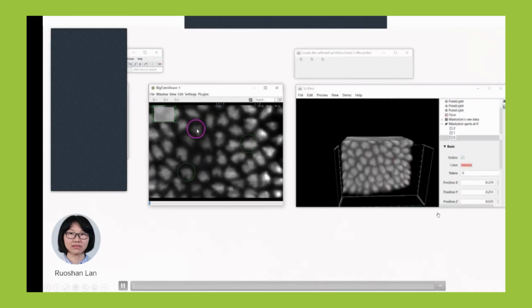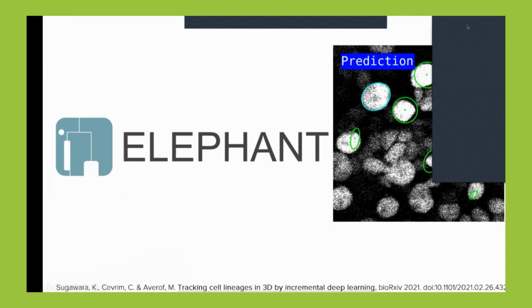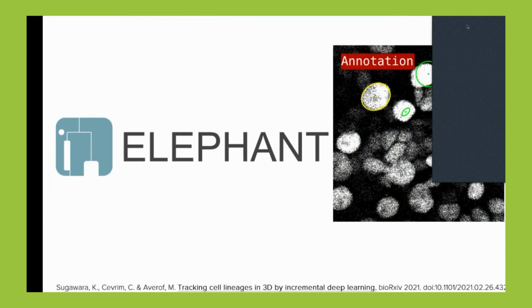Okay, so, as you can imagine, and this is the second elephant in the room, this time quite literally, going through a lot of cell tracks manually is quite a pain, and it turns into a combinatorial nightmare when you say, okay, I have the cell, it divides, and it divides again, and then you are at the Drosophila embryo with 10,000s of cells, and you're like, damn it. Now I got to track that manually or what? No, nobody does that anymore. So you do an automated approach, but you need to seed it somehow.